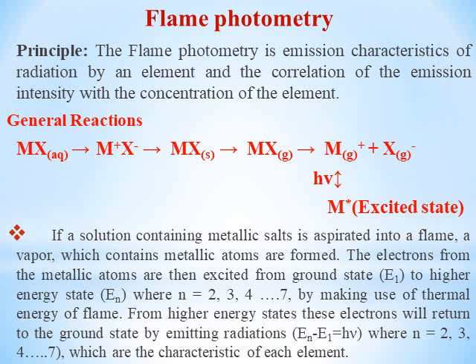This emitted intensity corresponds to the number of atoms present during the excitation. So that is the principle of flame photometry.